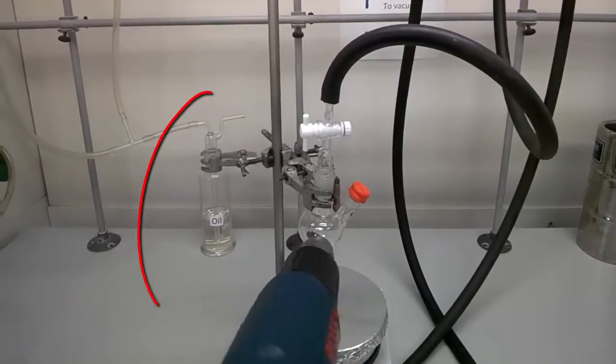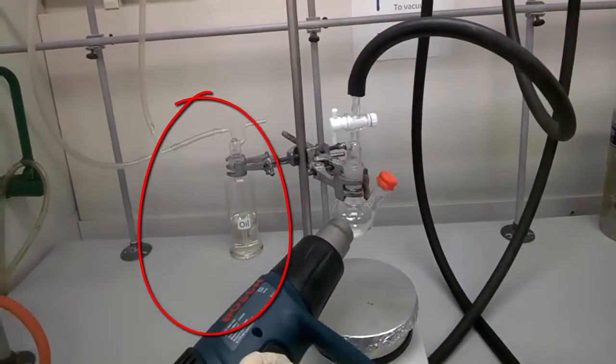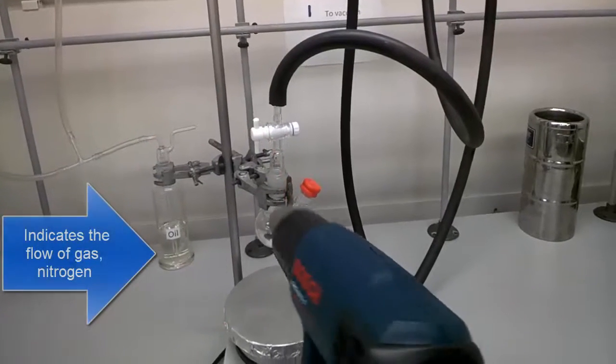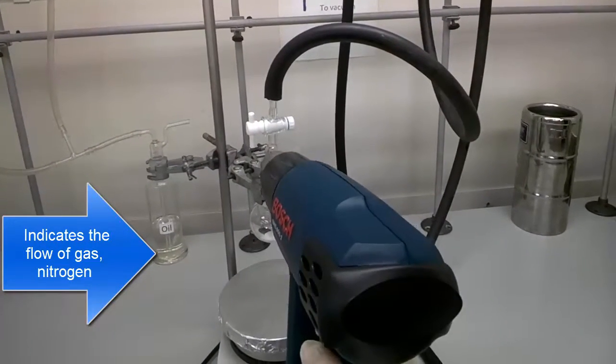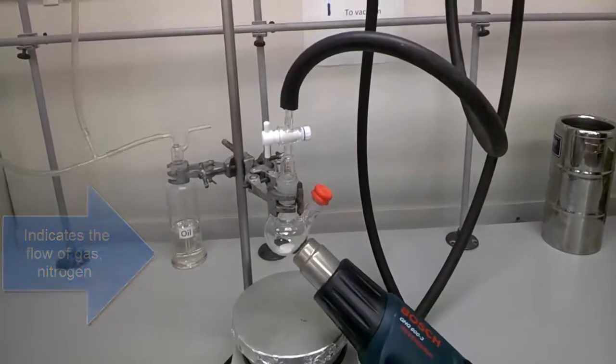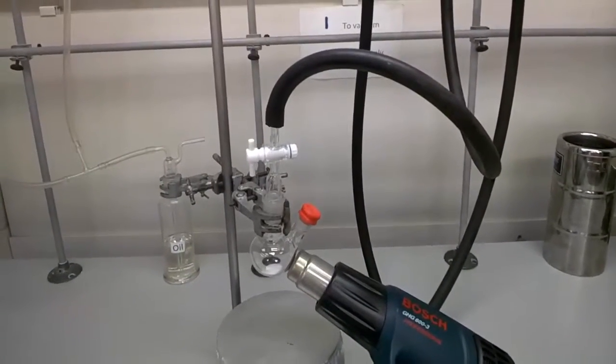At the bottom left-hand corner, you can see that there's oil bubbling, which indicates there's a flow of gas — in this case, it is nitrogen gas. It is very important for us to warm up all parts of the glassware, including the joint.